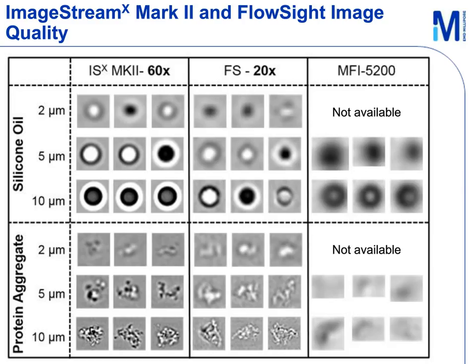Naturally, the minimum particle size that can be analyzed depends heavily on the quality and resolution of the imagery collected. As I previously mentioned, because the ImageStream and FlowSight use hydrodynamic focusing, it is possible to collect imagery at higher resolution compared to most other flow microscopy systems, which we hypothesize may allow morphological discrimination of smaller particles.